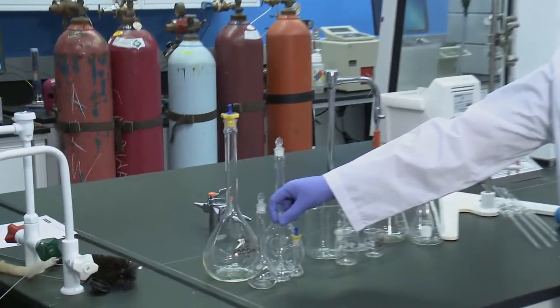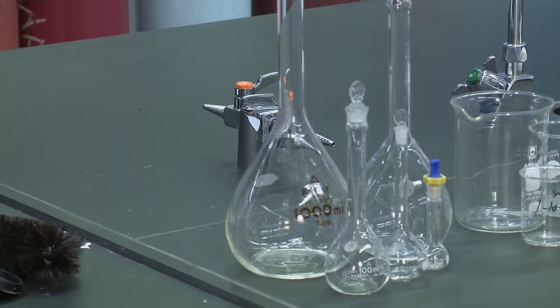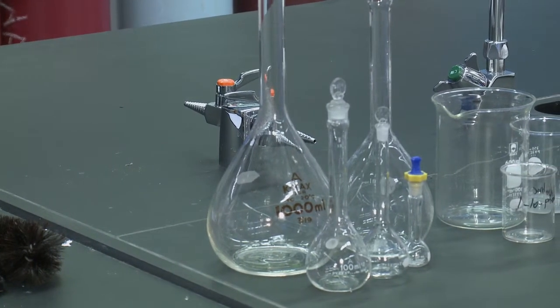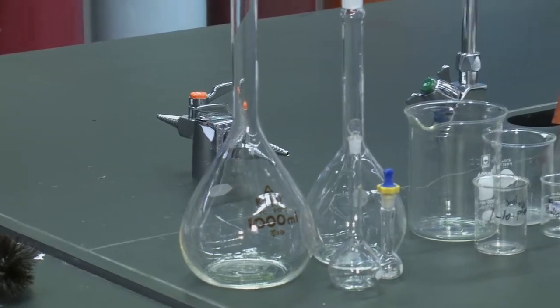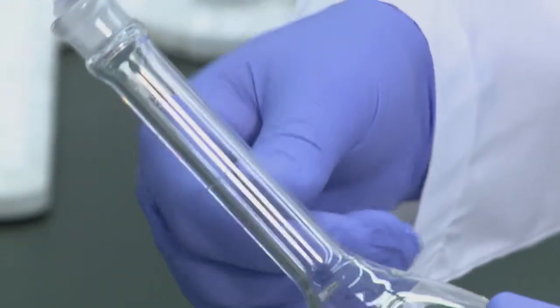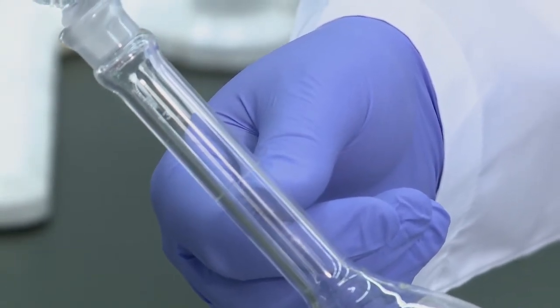First we have various volumetric flasks. These are used to make very accurate concentrations of different solutions. Each one of them comes with a single mark on it and can only be used to produce the volume that is on the label of the flask. These will be used to produce most of your standards and unknown samples in most experiments.